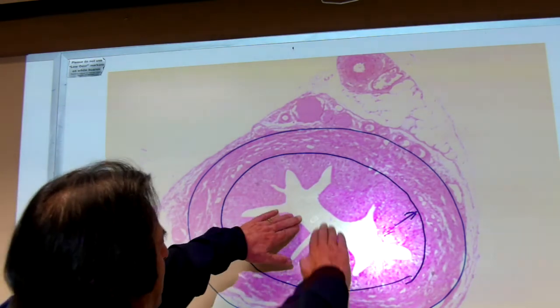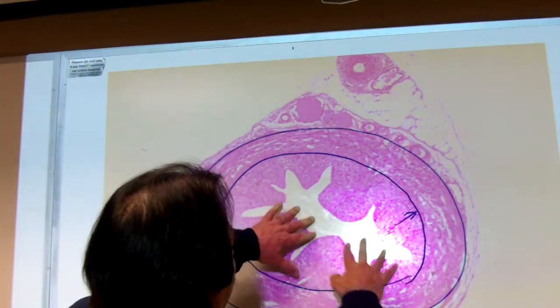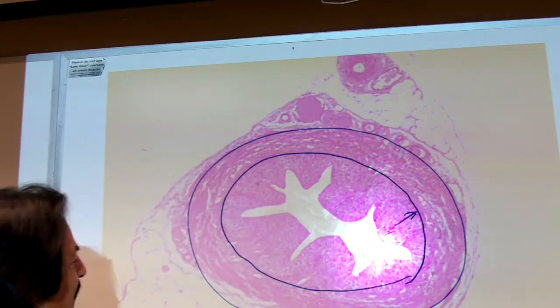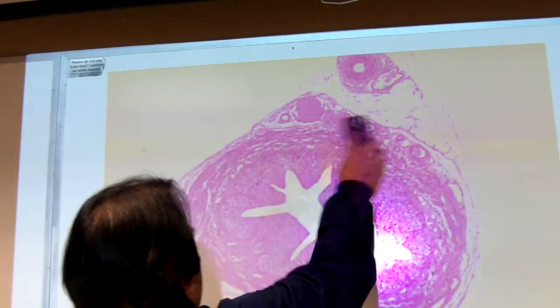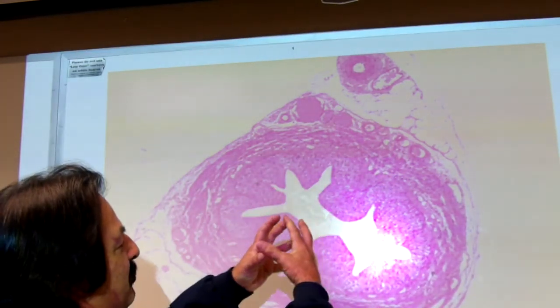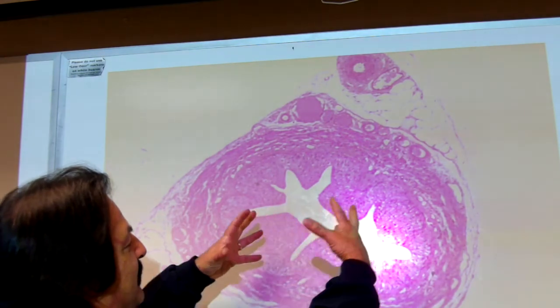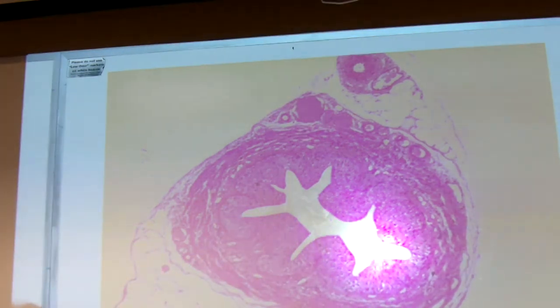All of this would be pushed out as you filled up with urine in here, and that is what you need to have, because what's going to happen over time is that this is going to transition, so your bladder expands, it contracts, it expands, it contracts, thousands, hundreds, millions of times in your lifetime. All right? And so transitional epithelium, pretty easy to identify.